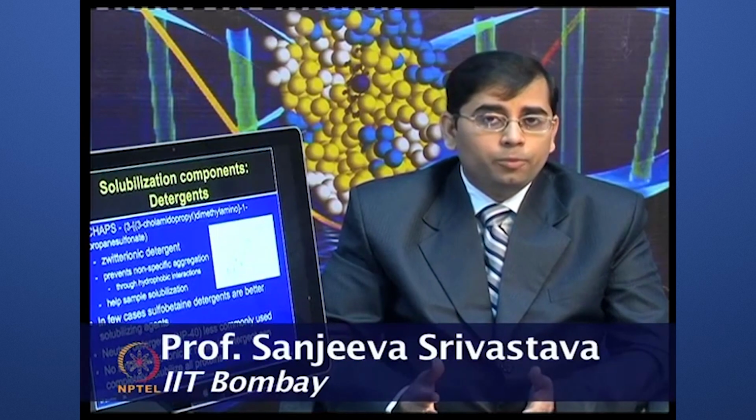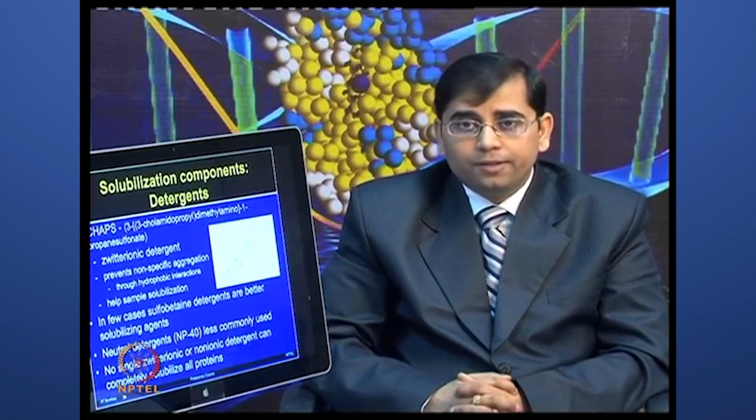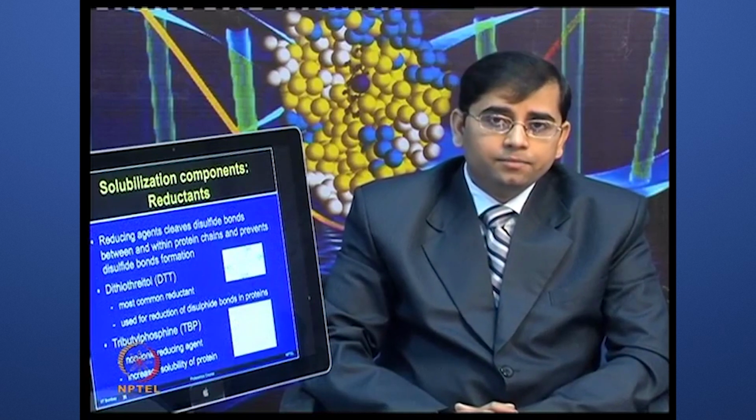No single zwitterionic or non-ionic detergent can completely solubilize all the proteins. So, depending upon your sample type, and if you know your sample is rich in a specific type of proteins, you need to try different types of detergents. Now, let us talk about reductants.